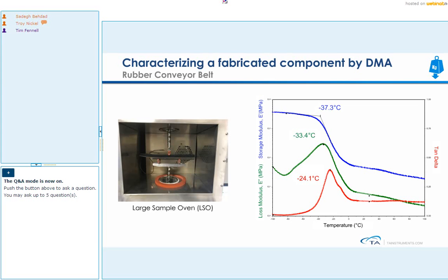So it's not a good practice to compare the TG that is measured by, say, onset of the drop in storage modulus with the peak of tan delta. Most people prefer peak of tan delta because that's the easiest.